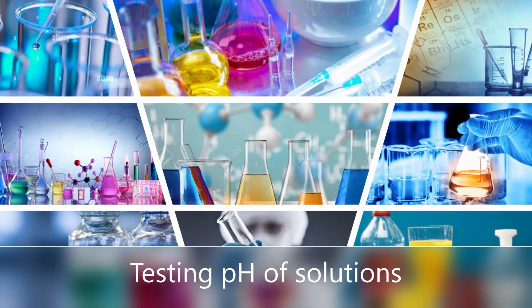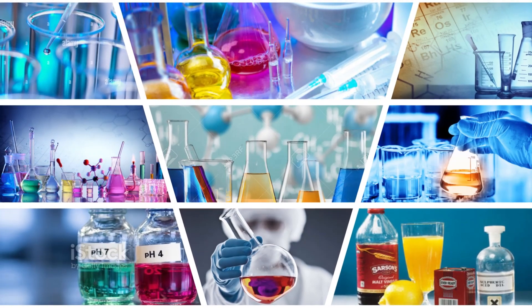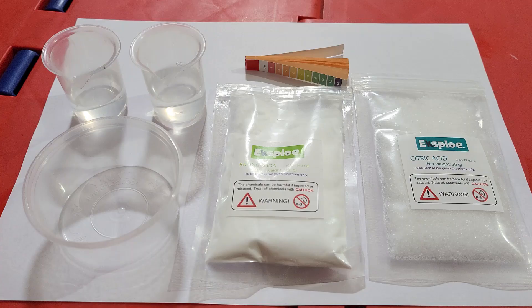Today, we will see the acidity of solutions using pH strips. For this, we need pH strips, citric acid, baking soda, and small beakers with 10 ml of water in each plastic bowl.